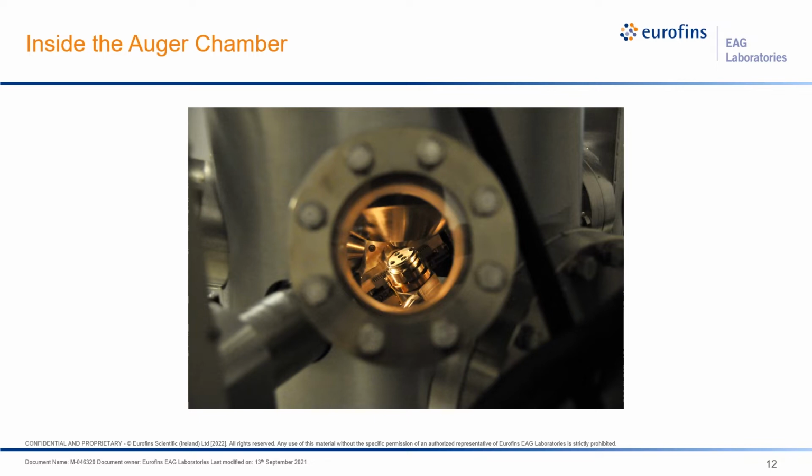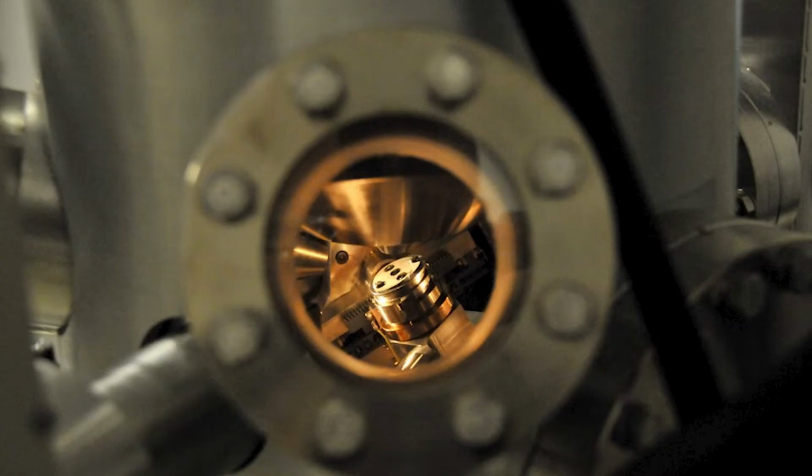Note that the sample is tilted 30 degrees with respect to the primary beam, which comes from this center cone here. The end of the CMA is this larger cone. This tilt angle enhances our detection of electron emission from the surface, which is strongest in the normal direction, so we tilt this sample towards one of the acceptance angles of the CMA. Off to the left, you can see the end of the ion gun.